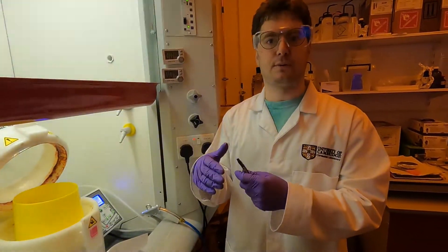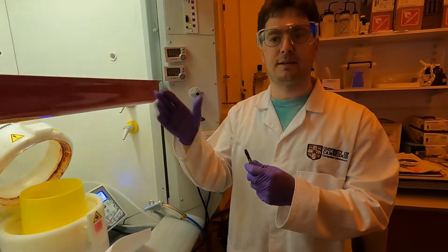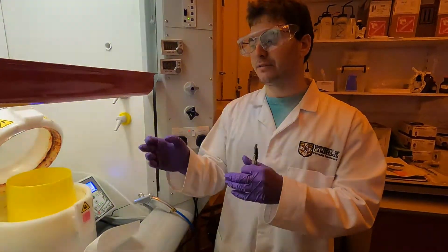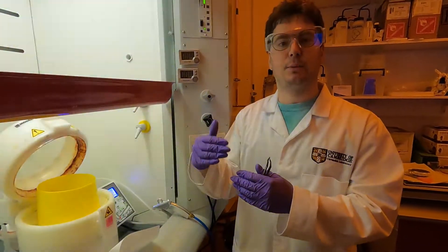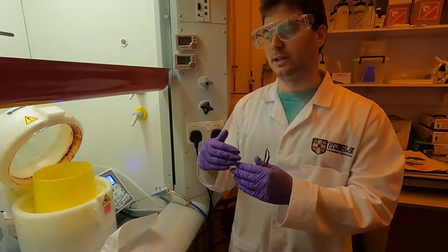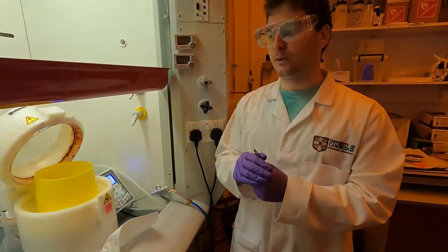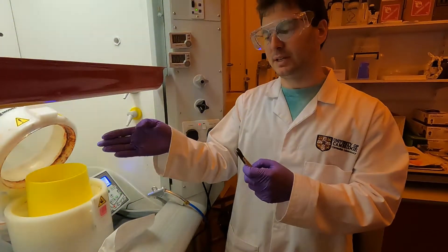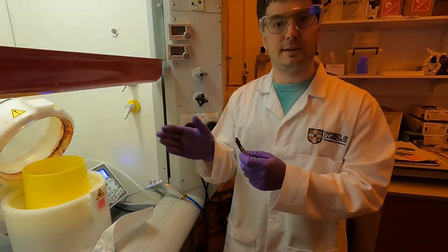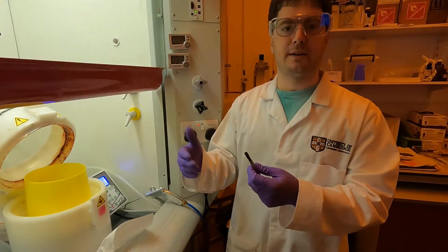You will see that in the data sheets this is really important for the thicker resist, so going from maybe 30 micrometers upwards. For the thinner resist you might also get away with a single step at 95 degrees, so if you're tight on time you can just do that. The data sheets for this particular photoresist SU8 2010, it's not really required to do a two-step process.